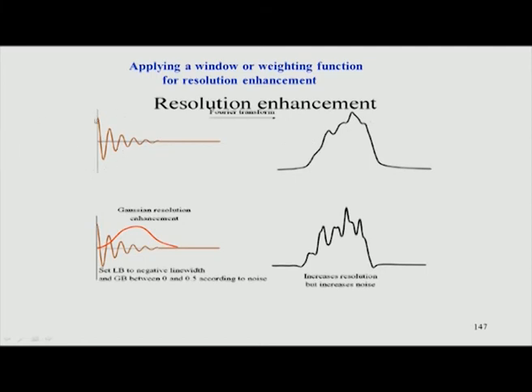This is what is shown in this slide also. If you look at this here, the emphasis is given on this part of the signal, and therefore, the line looks broad. But if I want to get a better resolution enhancement, then I will give less weightage here and more weightage this side. So, you can see here that lines are now getting sharper and there is a separation. Here you cannot make out how many lines or peaks are there, but here you can start seeing the peaks. Of course, not shown here, the sensitivity goes down because of less weightage given to the beginning.